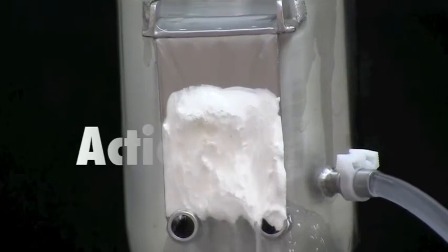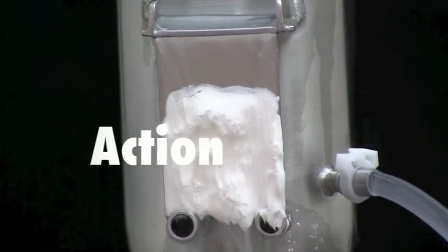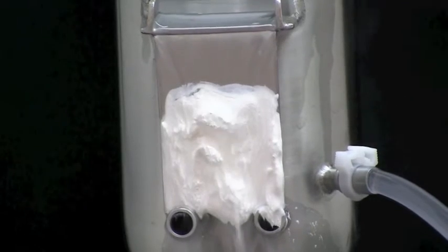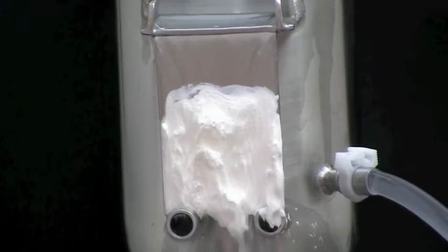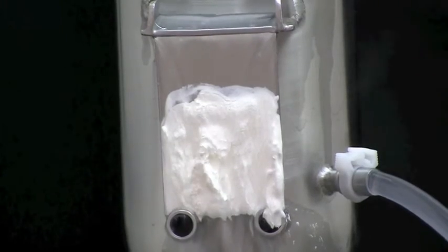A Action – The action applied to the surface during the cleaning operation is an important factor in detergent selection, whether that action is cascading flow, as shown here, direct impingement, fill and soak, or manual scrubbing.